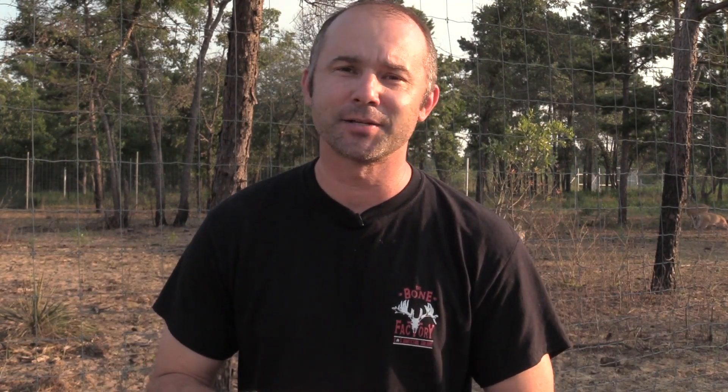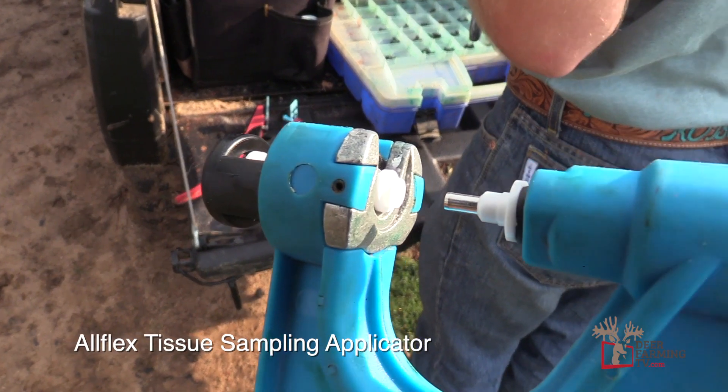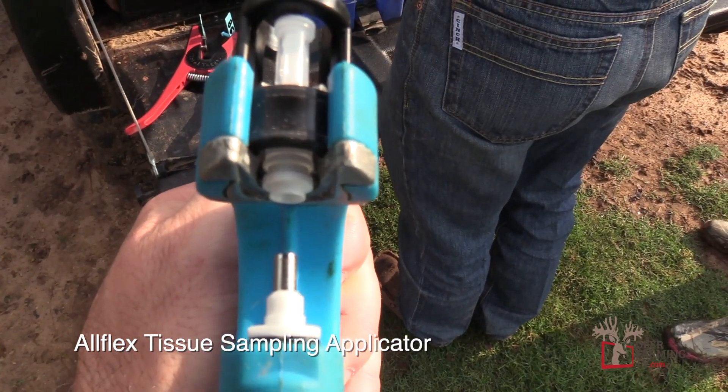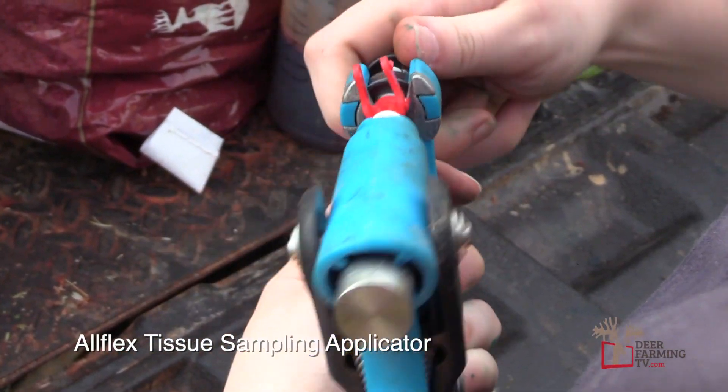Besides pulling hair for our DNA, we can also use a tissue collecting gun to pull these DNA samples. Allflex manufactures a tissue applicator, and it's basically the same as an ear tag applicator that we use in our deer pens. What it does is push the tissue into a tube, and it's really, really simple.